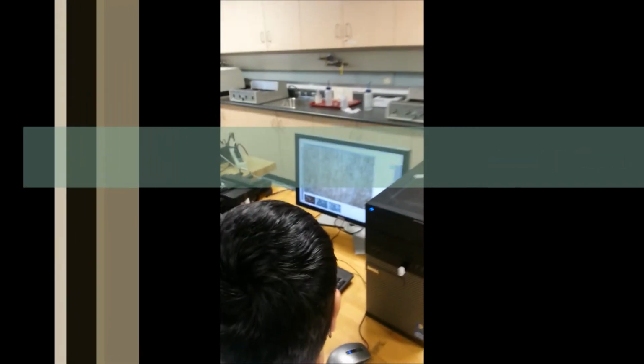Here we're looking at the microstructure of the sample after it has gone through the etching process. This picture shows what the oil quench steel microstructure looks like. We're seeing the grain sizes and the amount of carbon in each sample, with the quench sample having more carbon content, stating that it is a harder material. Also in it there's martensite and carbide. This picture shows the annealed steel microstructure, having a larger grain size, less carbon content, and more ferrite and pearlite.